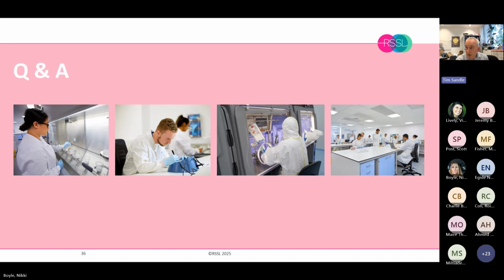No, from my experience, no. You really need surface data, and these days, often when you have an inspection, they say, "Bring me your surface data." So if you march in with suspension testing, you probably get a finding. Okay, no, that's very helpful.